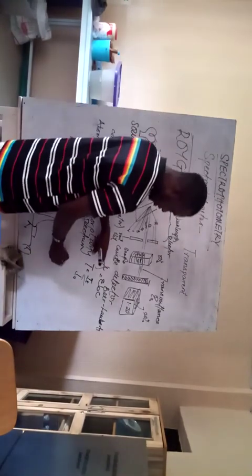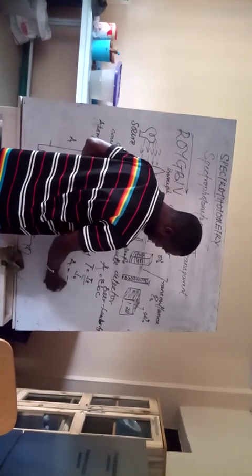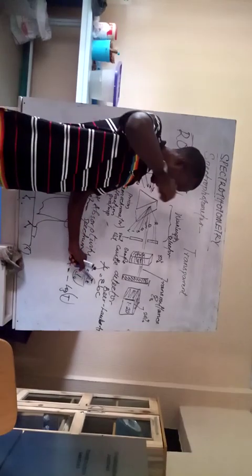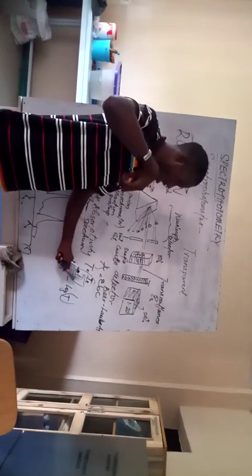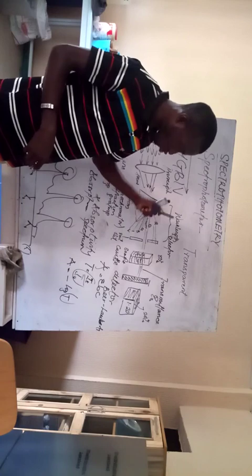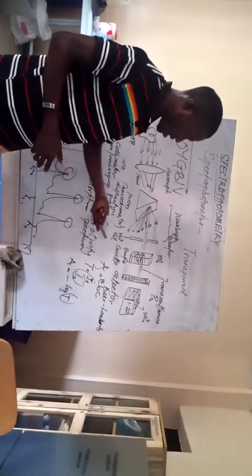The relationship between absorbance and transmittance is that absorbance is actually the negative logarithm of T. So you can also substitute this into the equation. We have IT, which is the intensity of light that is reaching the detector, and I0 is the intensity of light that strikes the cuvette. We are also going to talk about this calculation much later.